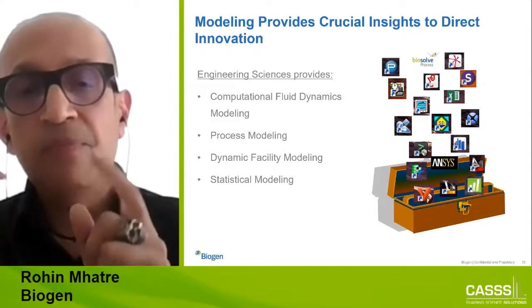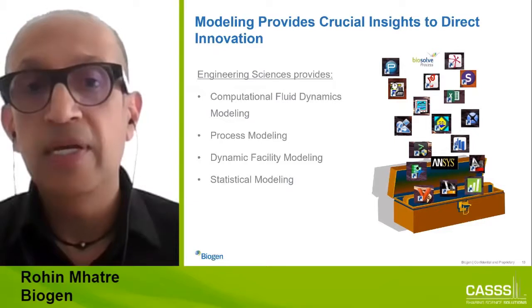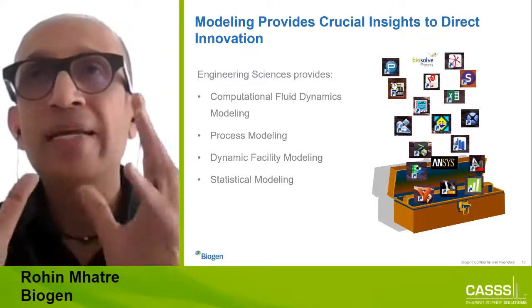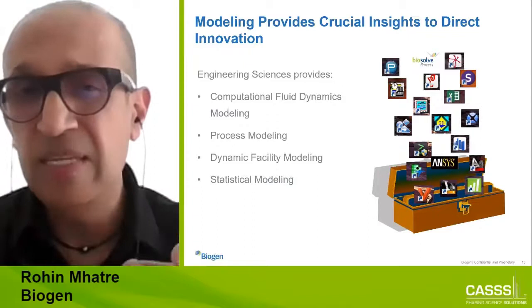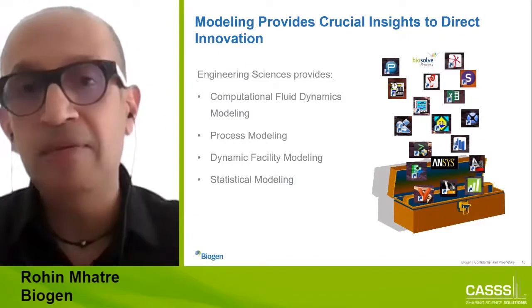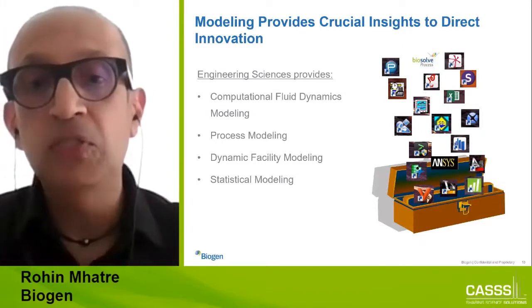But an area which I'm particularly interested in, and we've started to do quite a bit of work, is from a facility. We talk about all these things about controlling outcomes of processes, but the outcomes are controlled based on the instruments you use. It could be very simple in terms of a pump, used for pumping critical materials, feed streams, and so on.